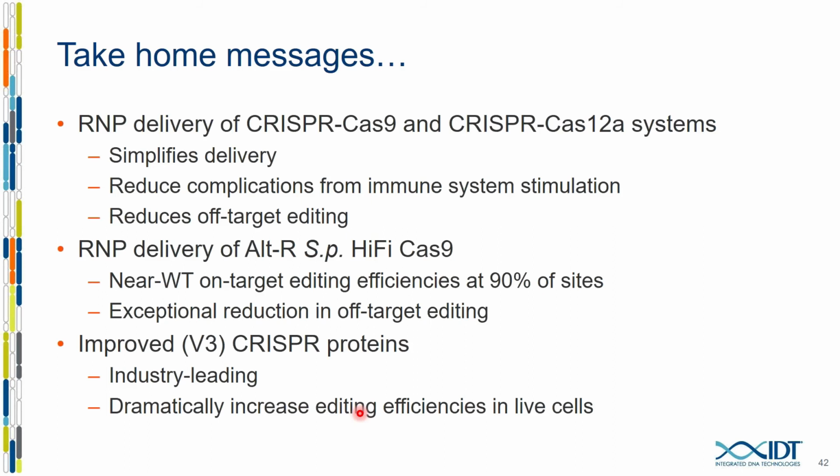The first question from Kelly is, do shortened guide RNAs work as well with IDT's HiFi Cas9? Yeah, so we don't recommend using shortened guides with wild type or HiFi because it seems to be very context and site dependent, whether they work or whether they don't work. And I think the HiFi is slightly more susceptible than the wild type, but in general, I wouldn't recommend using shortened guides with either.